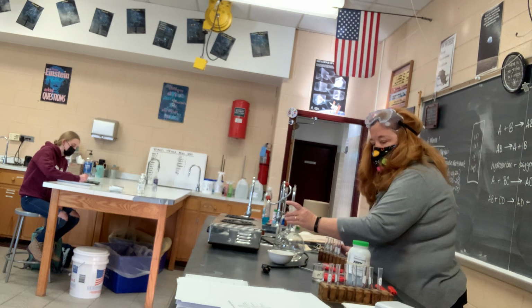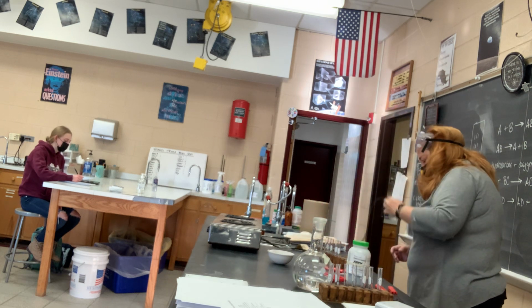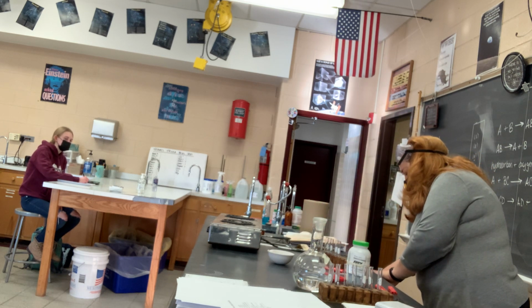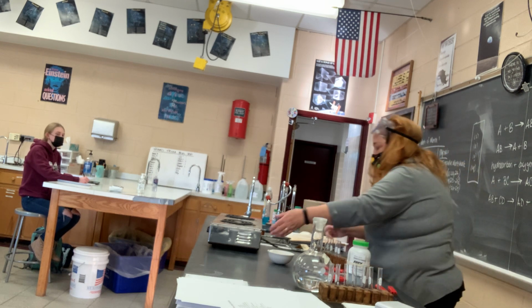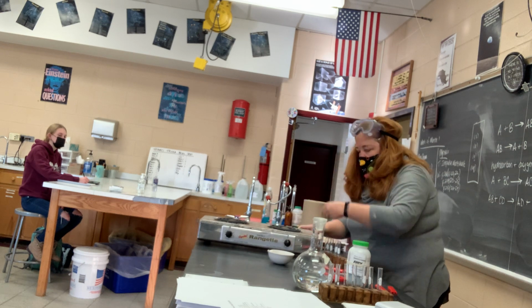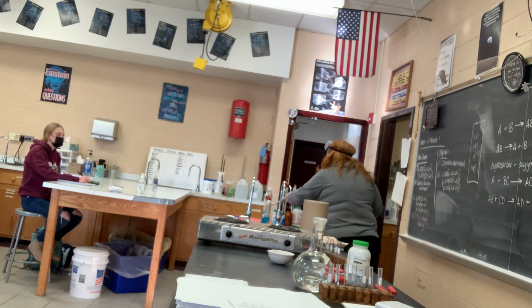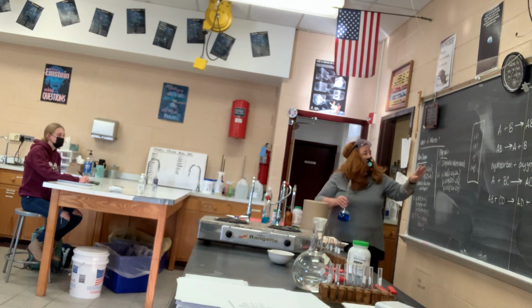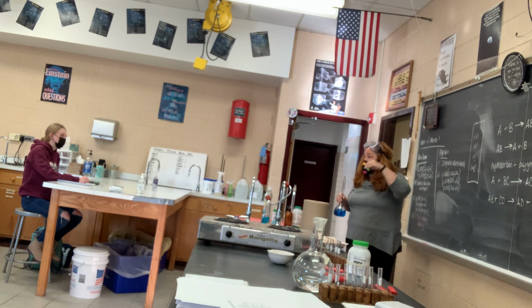I need to warm it up. We'll maybe come back to this one. I'm going to warm up some copper sulfate in a beaker. It says test tube, but it doesn't work as well. So when it says aqueous, solid, liquid, gas, I trap the gas in the test tube.